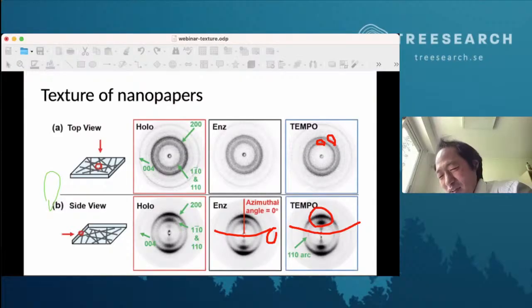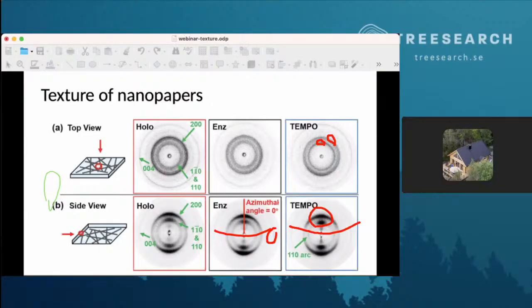Are you looking at the instantaneous contact angle, or is it staying over a long time? No, I think it's after 10 seconds, but they are rather stable at that time. So we waited for them to reach a stable level. It's not the initial one. Okay.